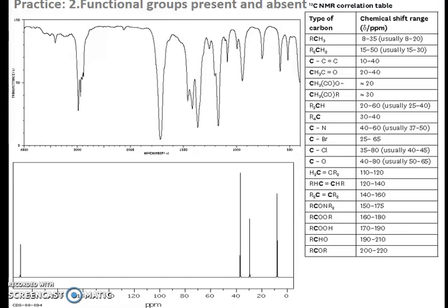This one is also interesting. It has very similar information in a lot of respects to the previous spectrum. But what's different about it? First off is that there is no shoulder peak on the carbon hydrogen peak, so it's not an aldehyde. We have a peak at about 210 ppm in the NMR spectrum, which is strongly indicative of the ketone, as is the peak at about 1710, 1720 on the IR.